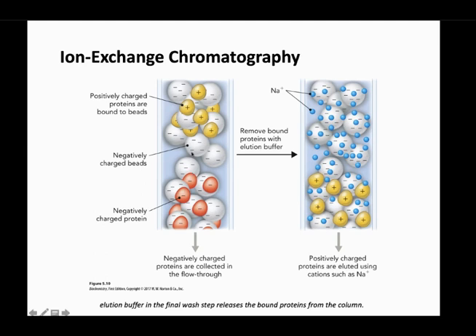You put the whole mix. All the proteins that are negative are eluted, meaning you will have them in the tubes as drops, right? You already get rid of all the negative proteins, but the proteins you are looking for are attached to the beads. Those proteins are positive. So you need a buffer that is an excess of positive charge. When you have a positive charge, it's going to bind to the beads and compete with the proteins, and it will exchange, and therefore you will have all the proteins that are positively charged. So you need something that competes with the proteins that you want in order to remove them from the beads, because you need the proteins to analyze. Okay? Thank you so much. That makes sense. Okay, good.